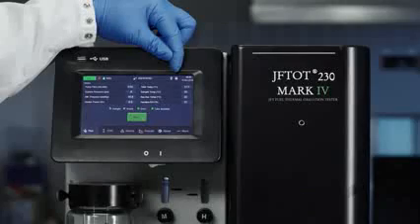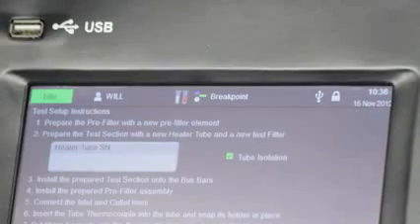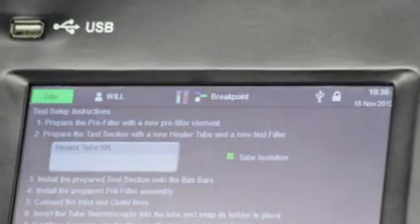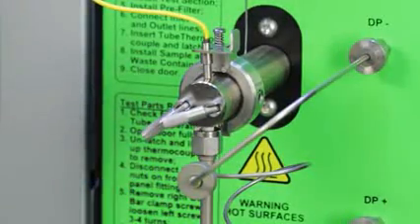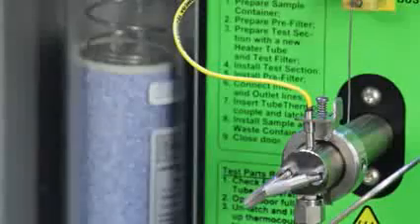User access including normal or service, and the system date and time. If you're familiar with previous generation JFTOTs, you'll recognize plenty of similarities, and what isn't similar is designed to be intuitive and easy to understand.